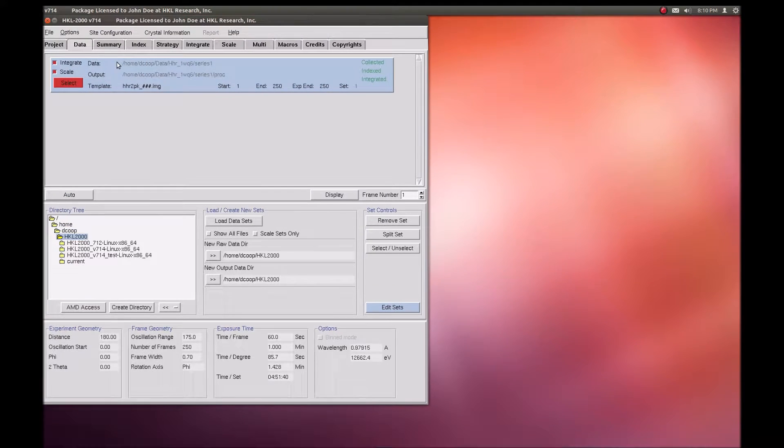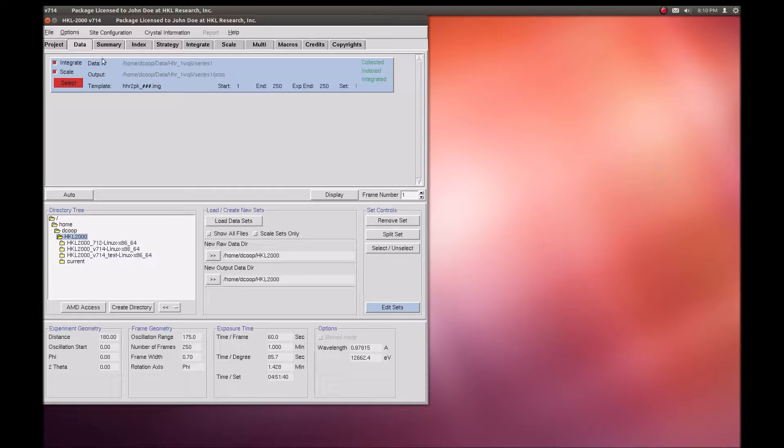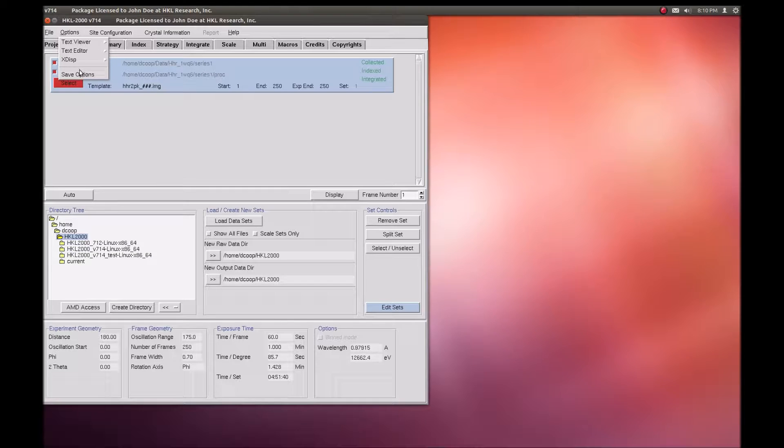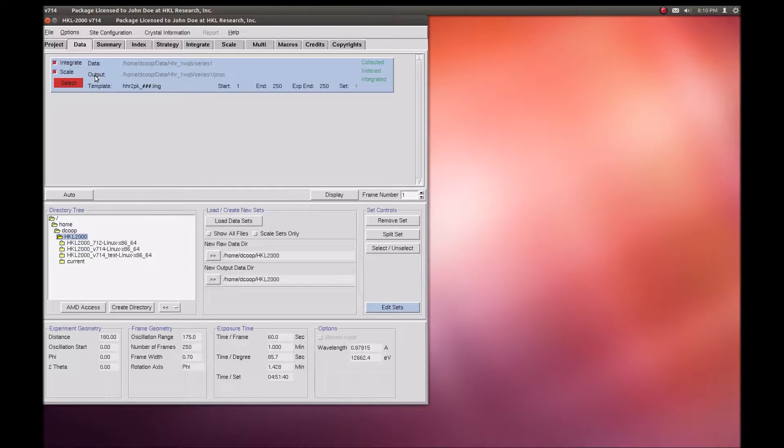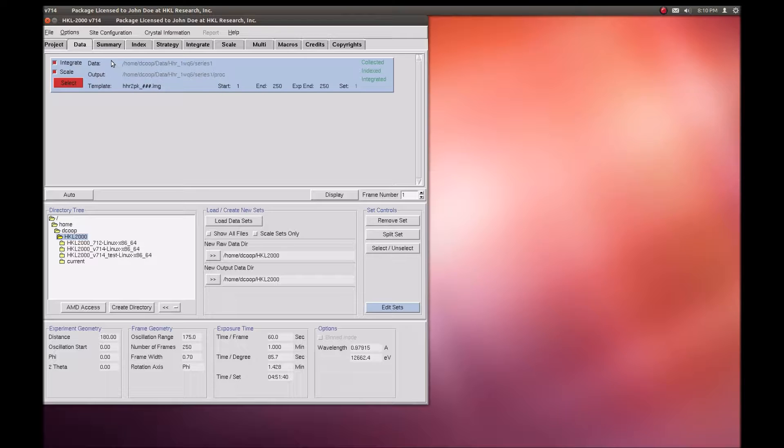You can switch back and forth between the new and old versions of XDISP as you like. To ensure you work with the new version every time, select Options, Save Options, while XDISP-QT is selected.